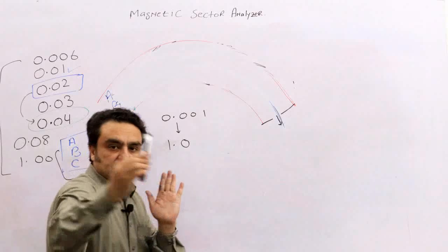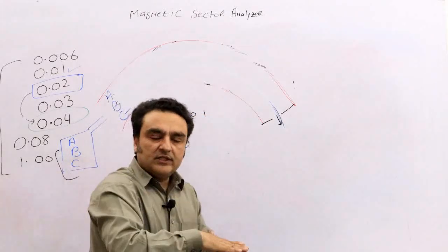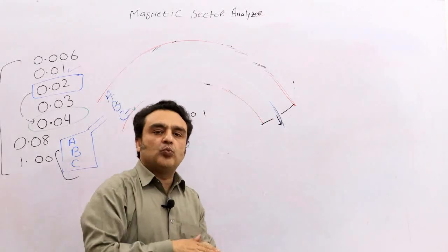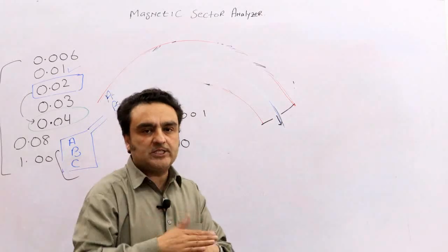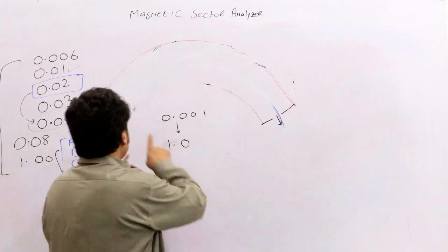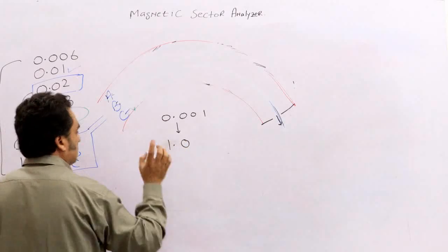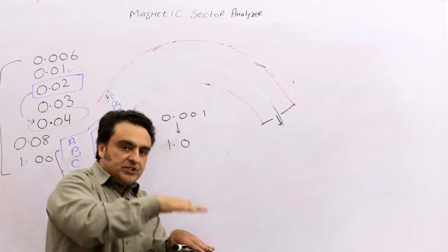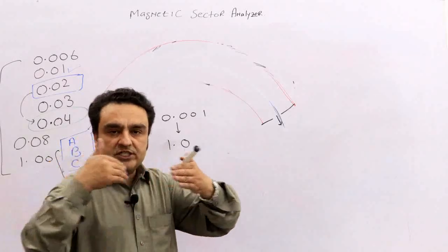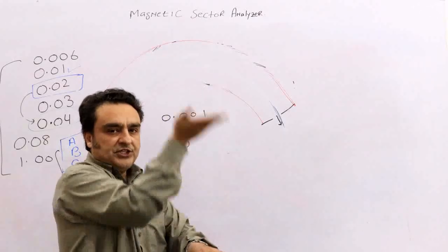Now the magnetic field will be scanning. Scanning means that it will be increasing or decreasing. Suppose you have 1 minute, maybe the magnetic field increases 100,000 times in 1 minute. It will be increasing or decreasing. So that increase or decrease in the magnetic field is what they call scanning. So it is scanning, or changing, or fluctuating, moving up and down.